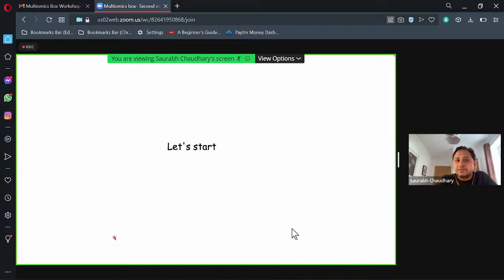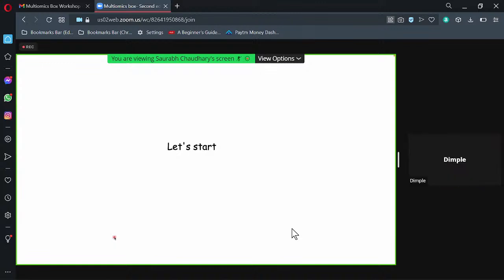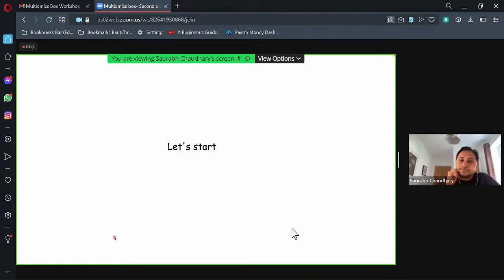You need a FASTA file for the transcriptome. It will give you the expression of the genes or mRNA, because it takes only the transcriptome, not the long gene sequence as a reference. I'll need to get the FASTA file for that. Yes, FASTA file. Okay, thank you.